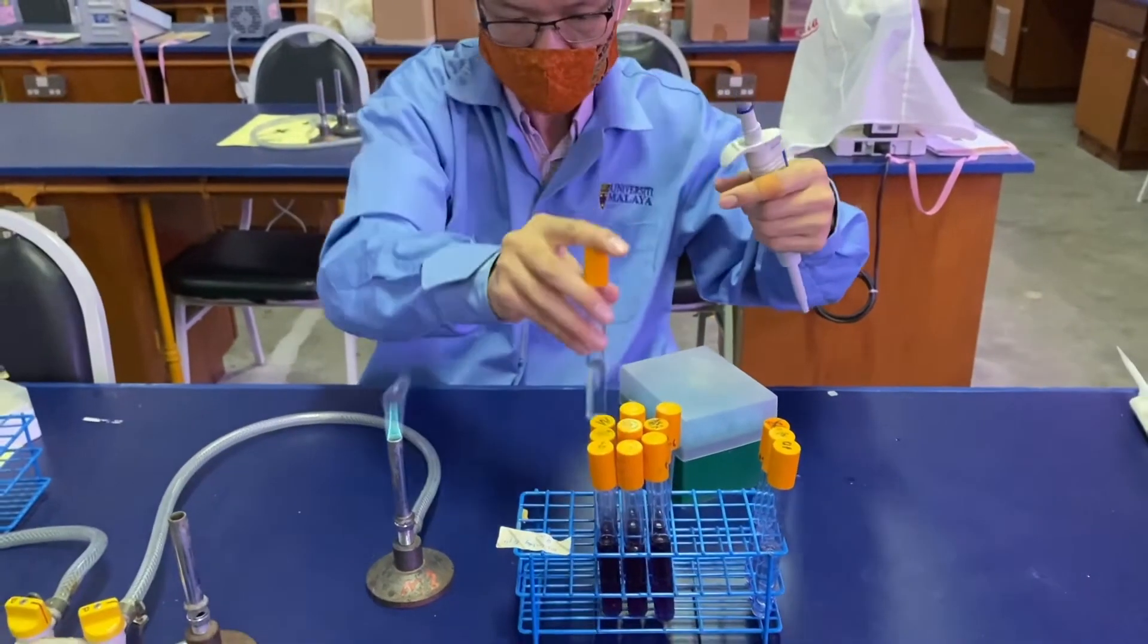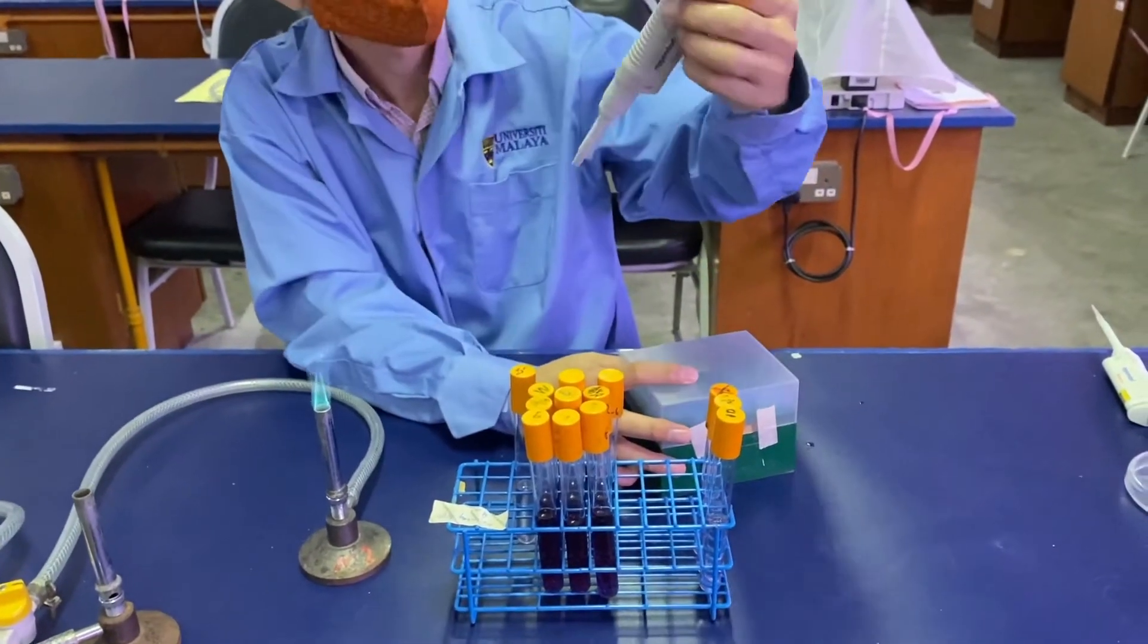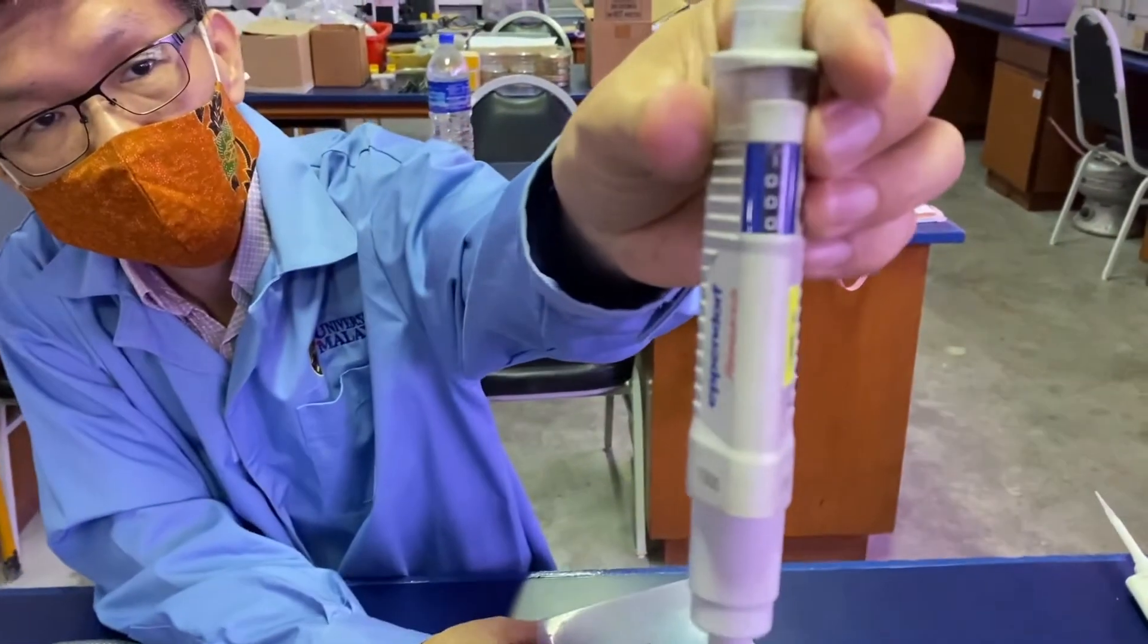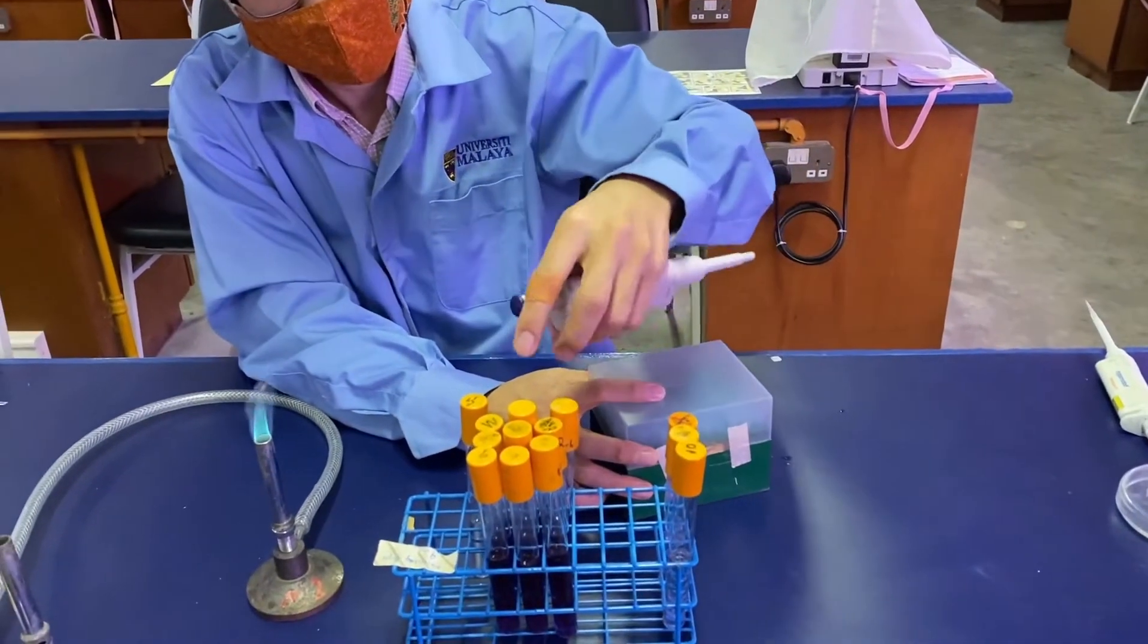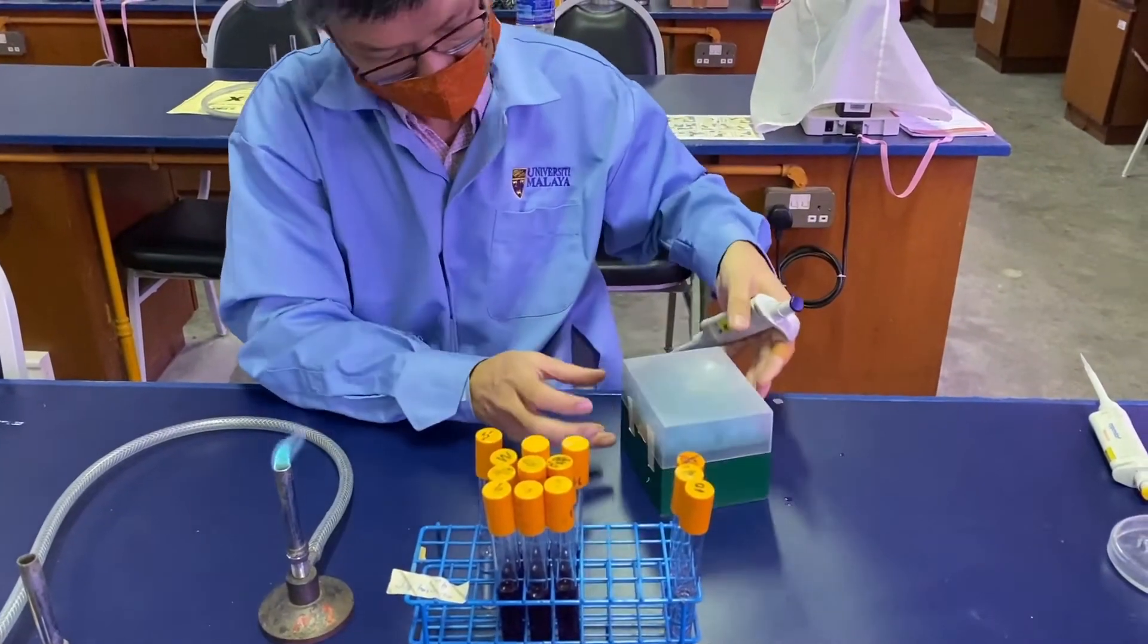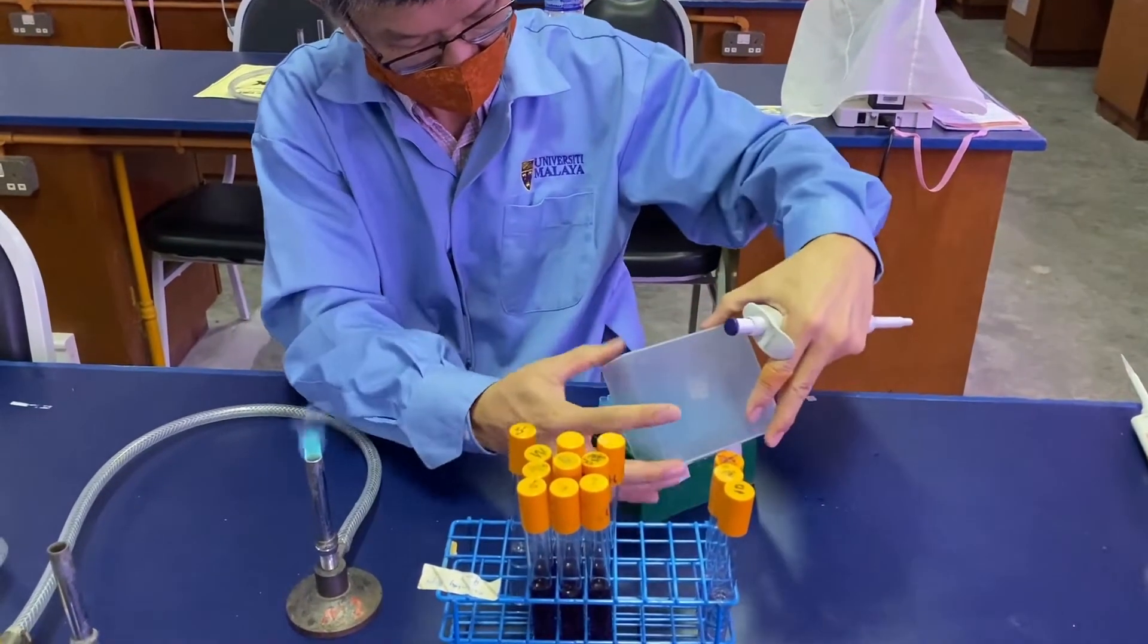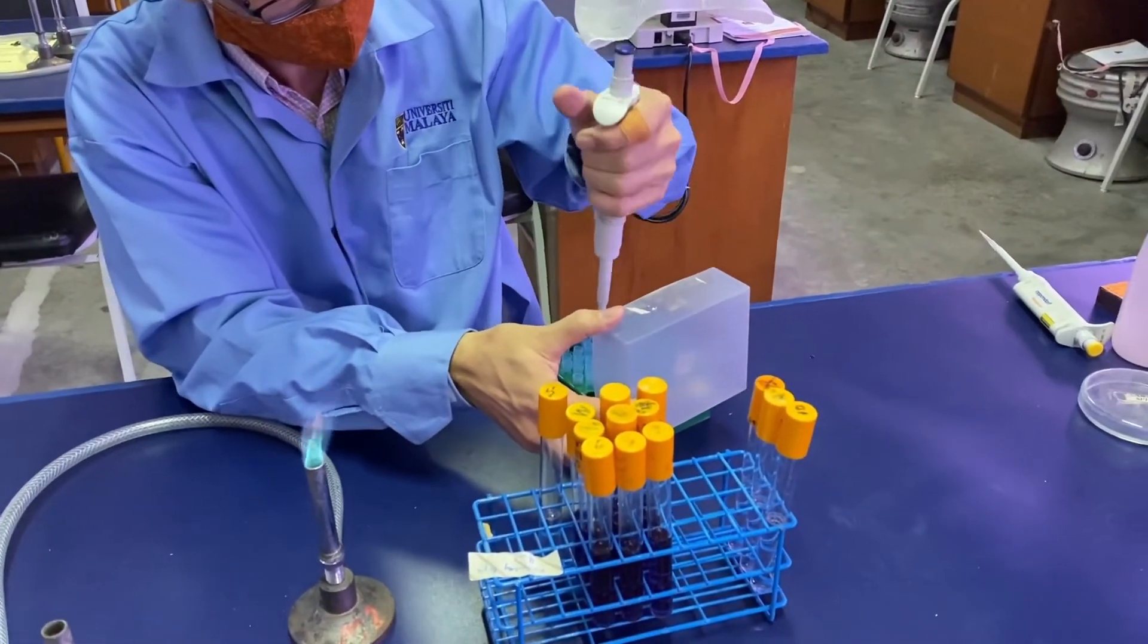This is the sample. All the test tubes have been filled with nine milliliters of broth and saline. Now we will use a blue micropipette to place one thousand microliters, or one milliliter, of sample into the first dilution tube.